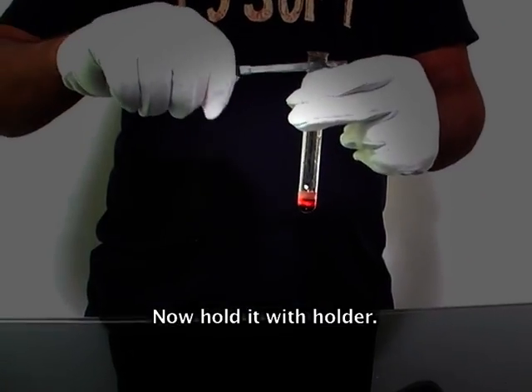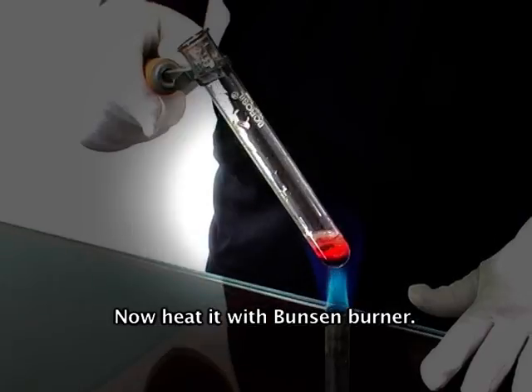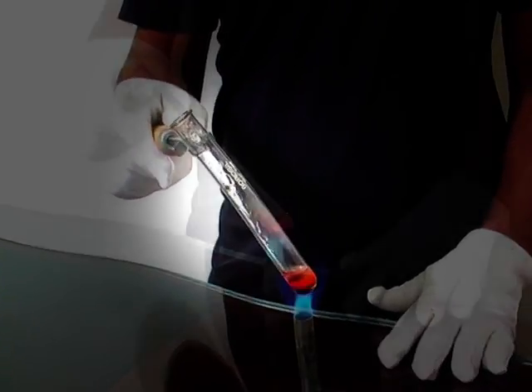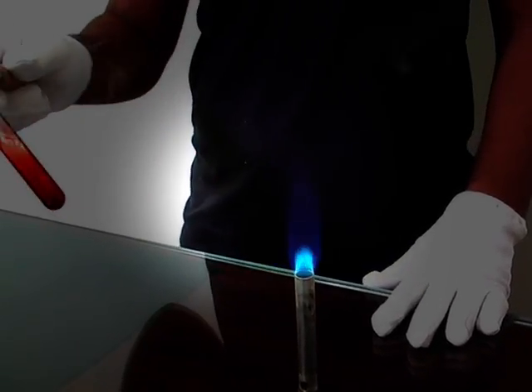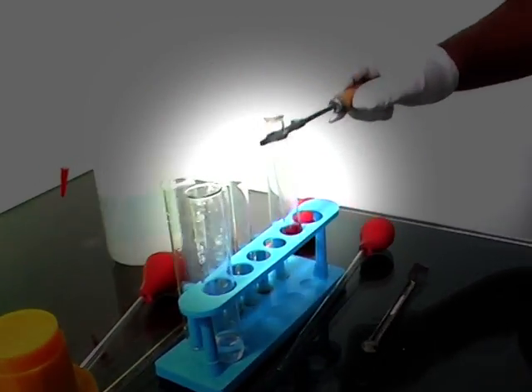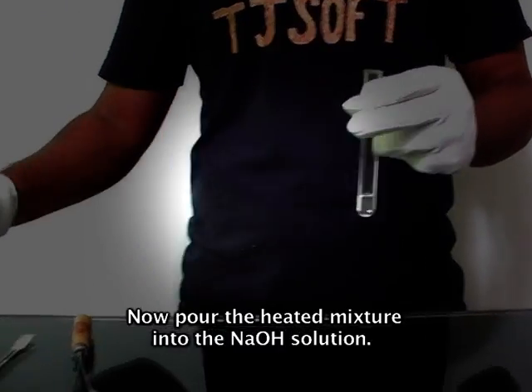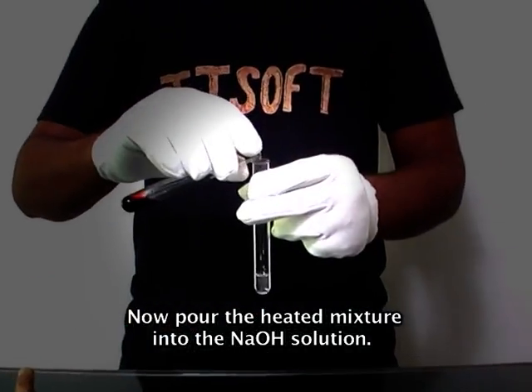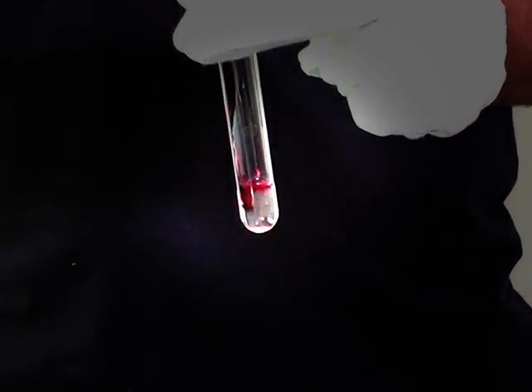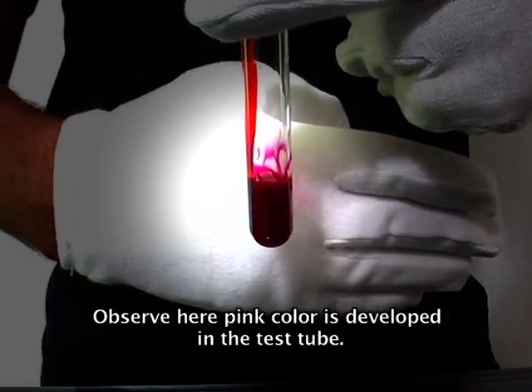Now hold it with a holder and heat it with the Bunsen burner. Now pour the heated mixture into NaOH solution. Observe here — a pink color is developed in the test tube.